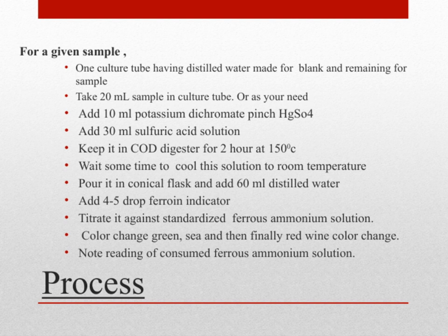Be sure to note the volume of ferrous ammonium solution used, as this reading is essential for calculating the chemical oxygen demand. This process allows us to assess the amount of oxygen required to oxidize the organic matter in your sample, which is a key indicator of water quality.